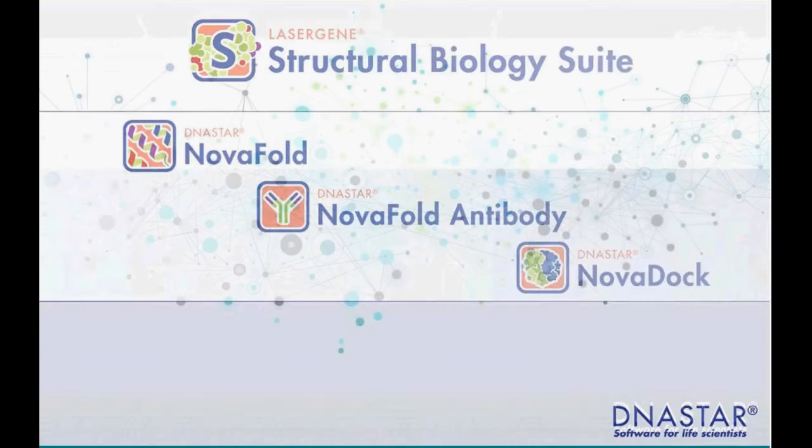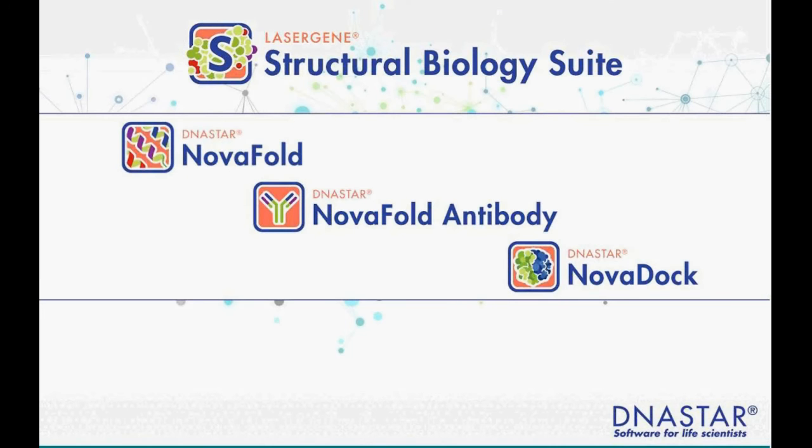Before launching into NovaFold specifically and its workflows, I'd like to introduce the full lineup of our Nova applications in the LaserGene Structural Biology suite. We have 3 applications currently in the Nova line. Our first is NovaFold, which we'll be talking about more today for protein structure prediction.